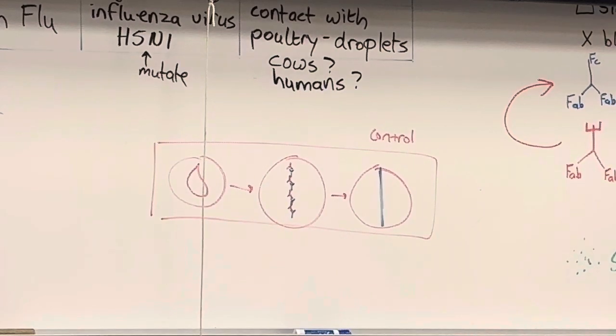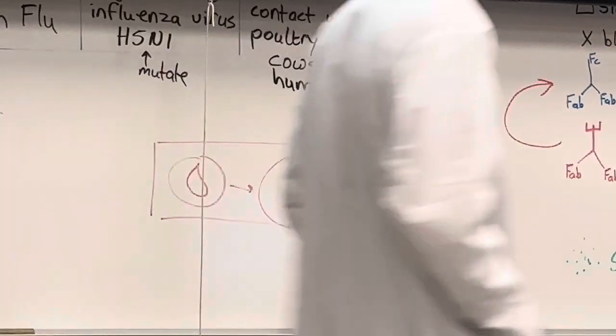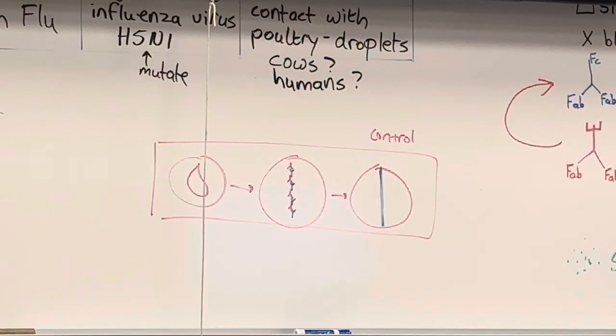So let me show you what you need. What we're doing today is a simulation. It's not that much fun to do a simulation versus doing the real thing. But with the real thing, we don't really mess with viruses, and we don't want to mess with patients' blood or serum. I have seen labs that test animal blood for antibodies, which is kind of cool, but we're just going to do a simulation.